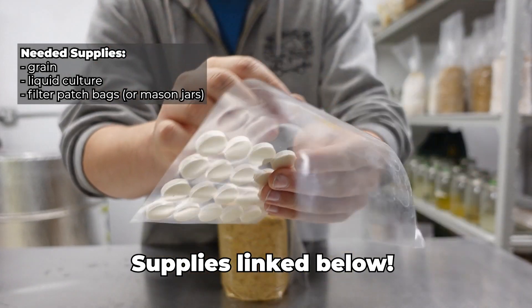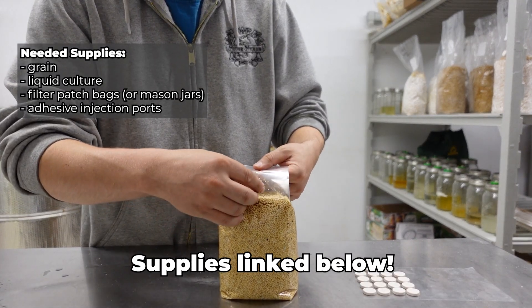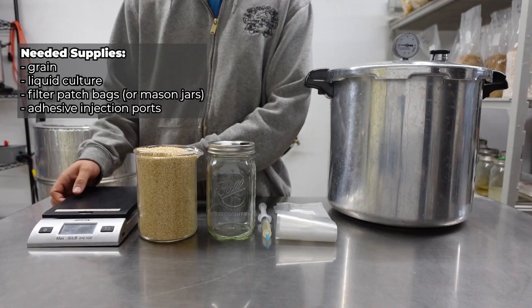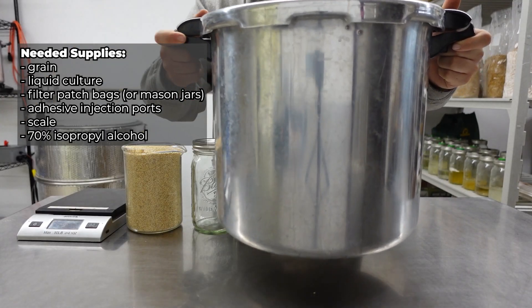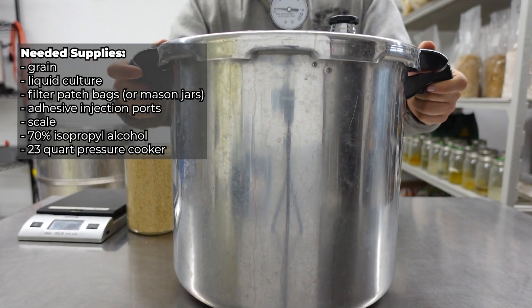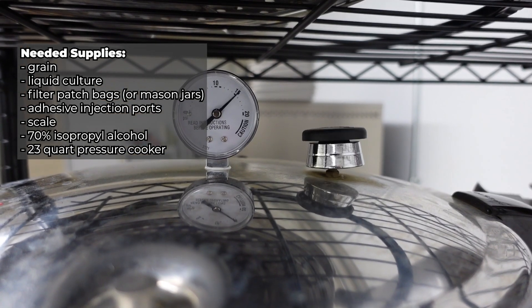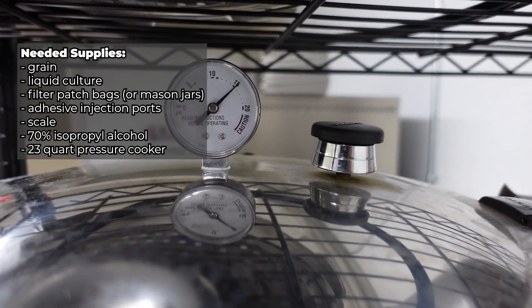If you're using Unicorn bags, then you'll want to buy adhesive injection ports that you can stick on your bags to help with inoculation in open air. You will need a scale and isopropyl alcohol. Lastly, you will need a large pressure cooker or sterilizer. For some processes in mushroom cultivation, a pressure cooker is not needed, but for making grain spawn, it is required.